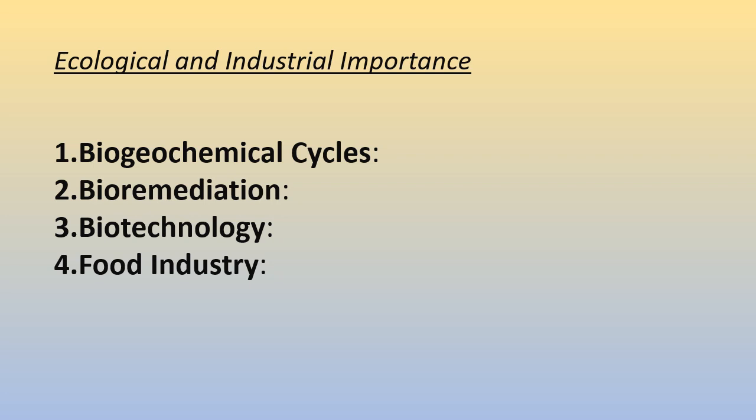Now, other than our practical work, our lab work, you need to know a little bit more about halophiles, because you will get questions in your viva. So first is their ecological and industrial importance. Why study halophiles? What is their significant role in our ecosystem? You should know. So first is biogeochemical cycles.